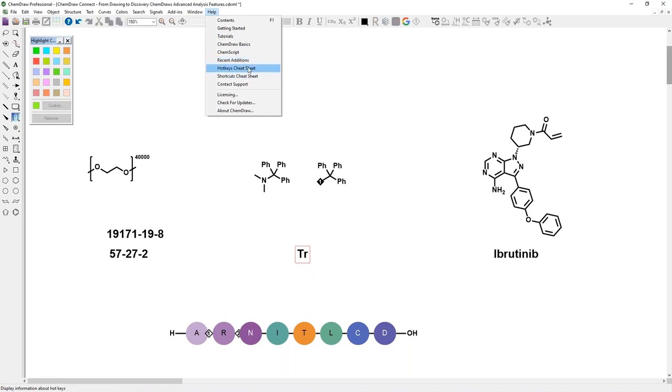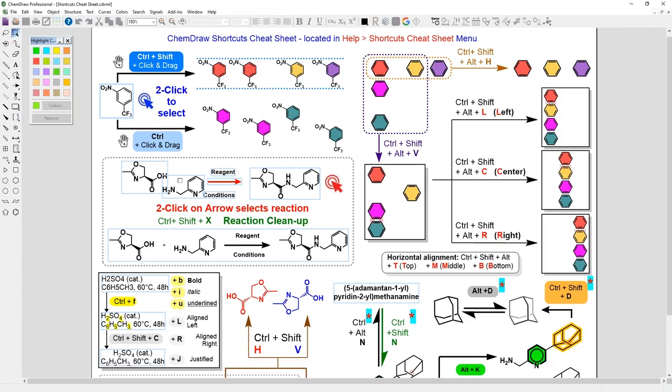And there's also, of course, the place which I would highly recommend to everyone that's not using it yet: the summary, the cheat sheet for the hotkeys. This was useful for drawing molecule structures by hand, and also covers all different shortcuts. These are additional keyboard combinations that exist, that you can use to save some time.